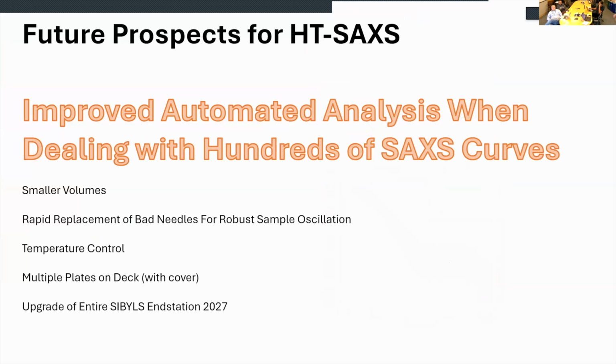So the future prospects for the high throughput system: we have till June 2026 before the whole ALS shuts down, right? So we'll see how many of these things we get to before the shutdown occurs. But the number one thing that we really need to do to make the high throughput work better is the analysis.